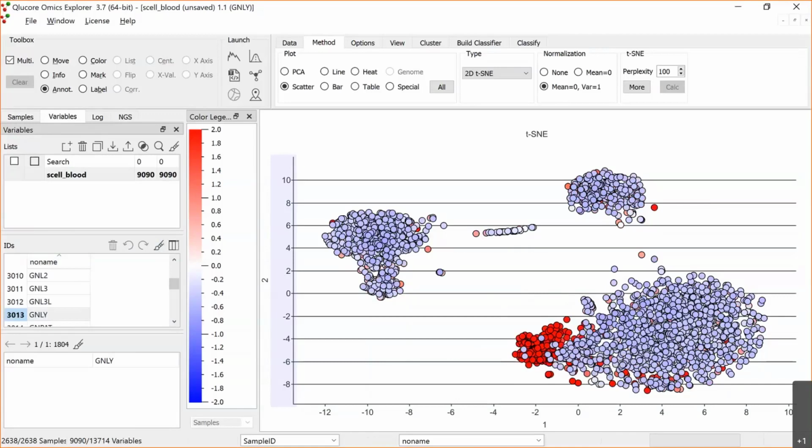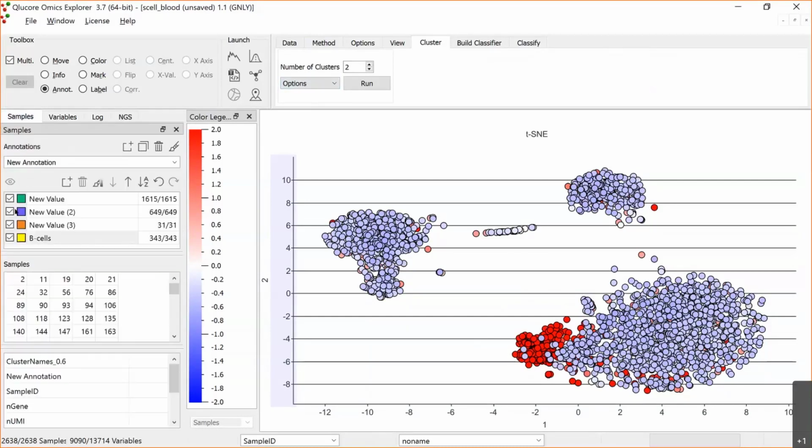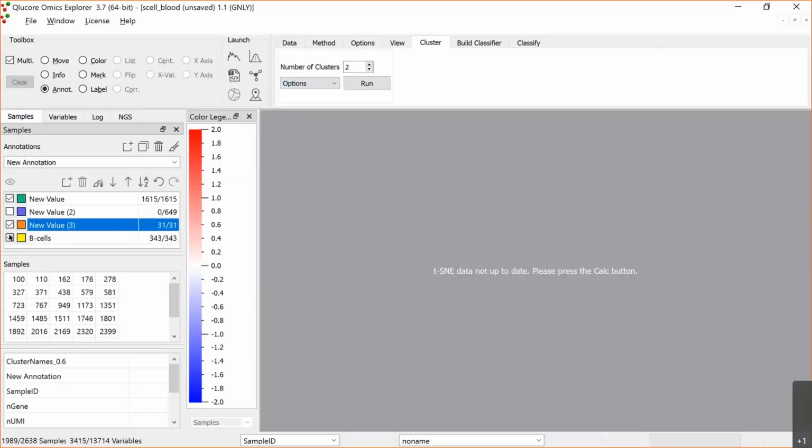Okay, so I could try to just circle this in the same way as I did before, but instead we will use another function in the software, which is the k-means clustering, which will help us to create the clusters. So let's take away everything else now and only keep the green samples.